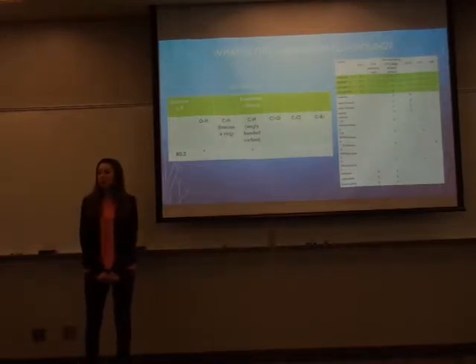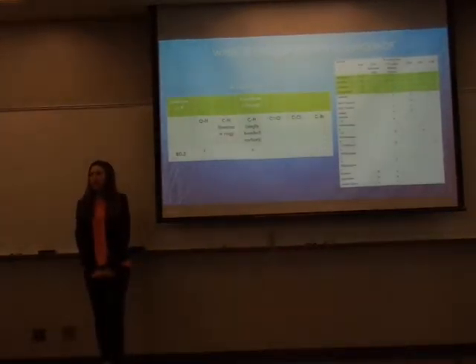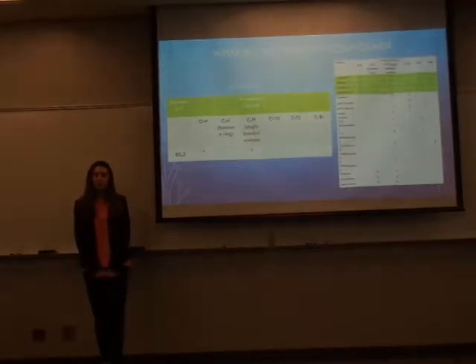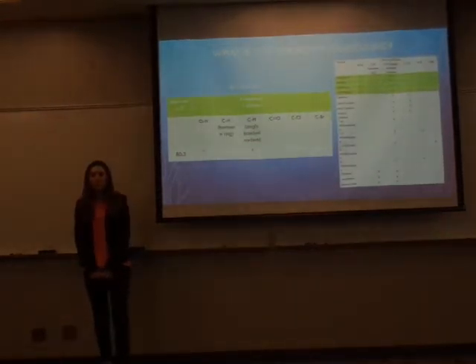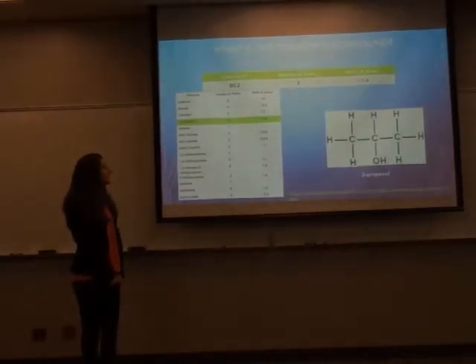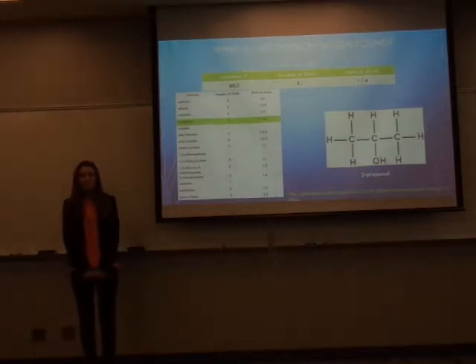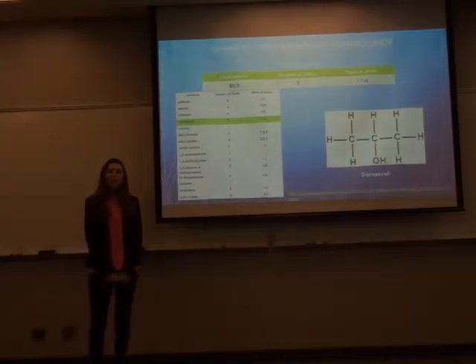This allows us to narrow our focus to 4 possible compounds: methanol, ethanol, t-butanol, and 2-propanol. Now we can look at the NMR spectra once again, and we see that there are 3 peaks with a ratio of 1 to 1 to 6. This allows us to identify our unknown compound as 2-propanol.